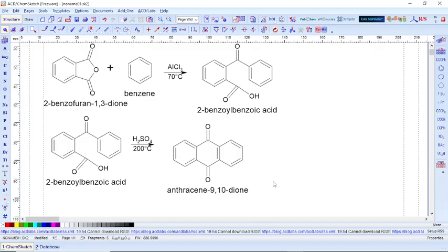Now, you begin to ask yourself, what amount of the product do I need? And maybe in your synthesis, you want to at least synthesize like 10 gram of the product. Maybe that is your target.